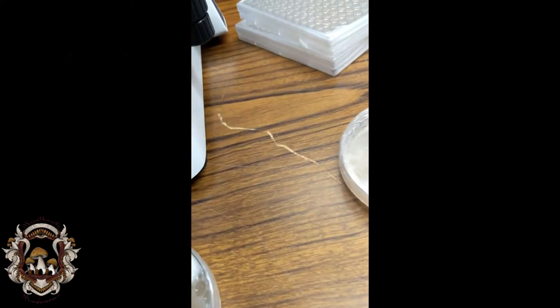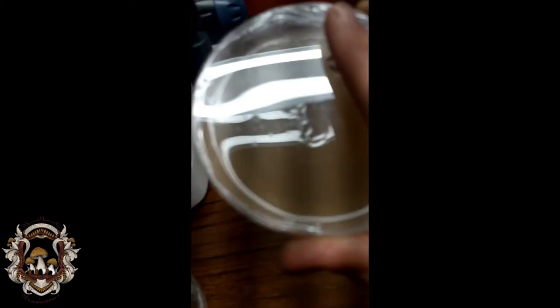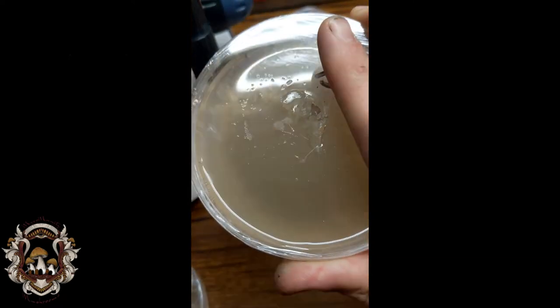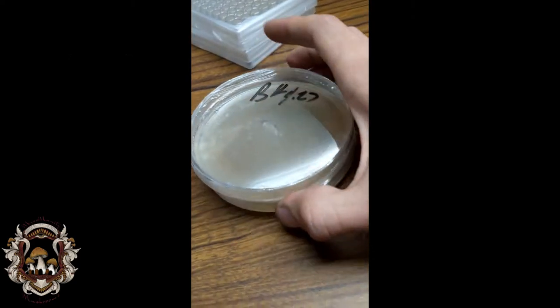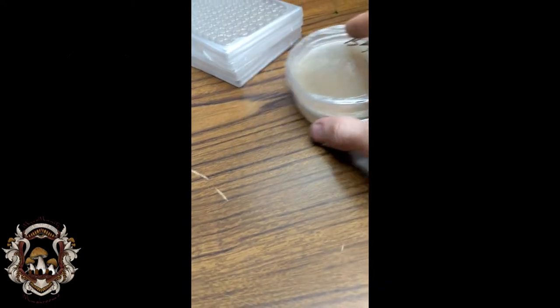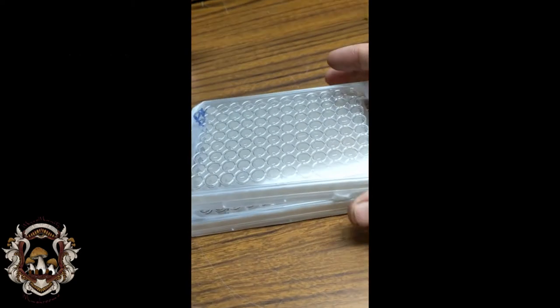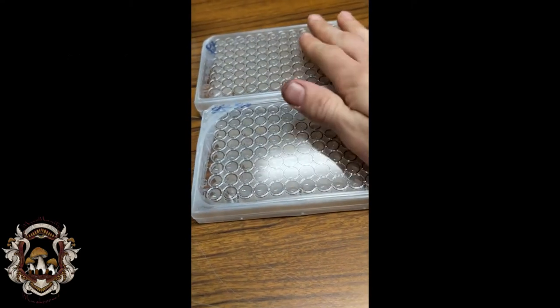So, try to focus in on that. You can kind of see right there. So, they're not sterile. They don't seem very aggressive, however. With that said, we are going to look at these under the microscope now. So that's going to be its own thing.